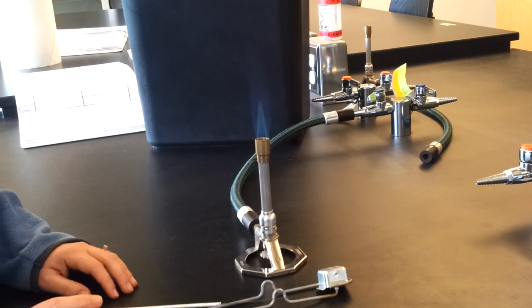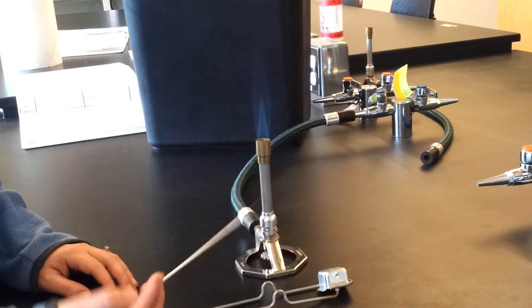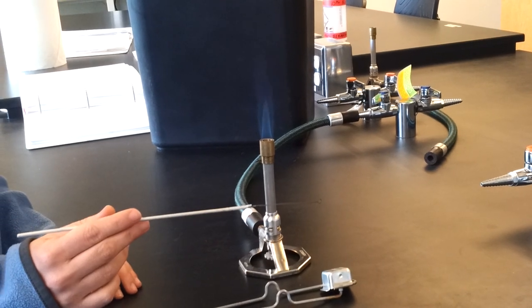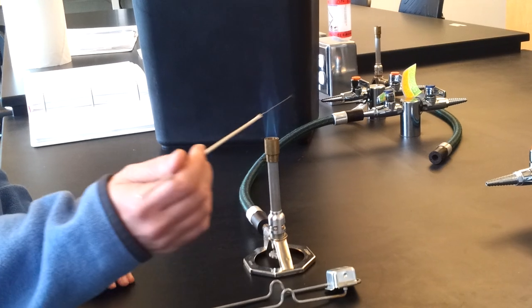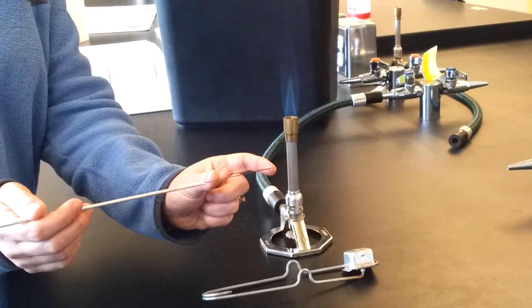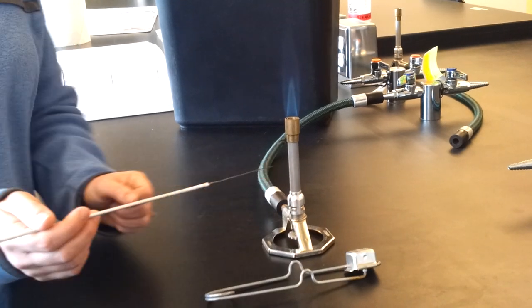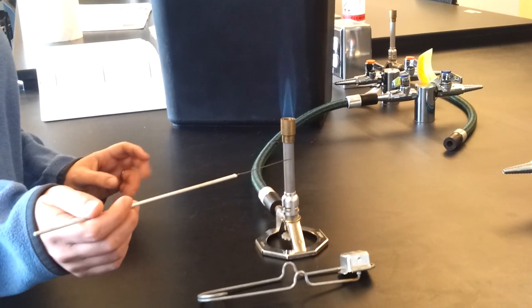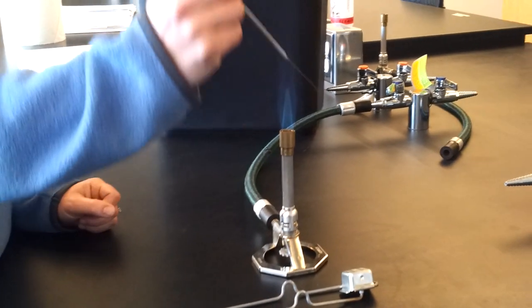Now the whole purpose of the flame is to sterilize your inoculating needle. This is what you'll be transferring bacteria with. So in order to sterilize it, you're going to put it in the flame and try to get about 90% of that wire an orange color. And as soon as it turns orange, you know that it's been properly sterilized.